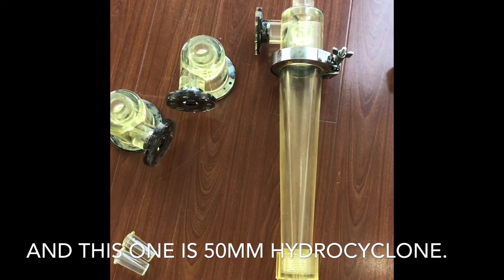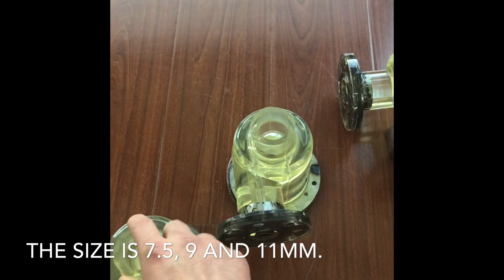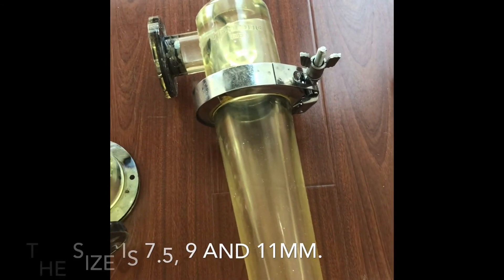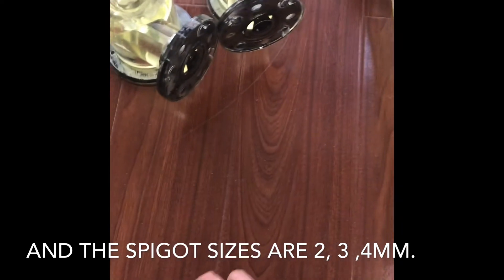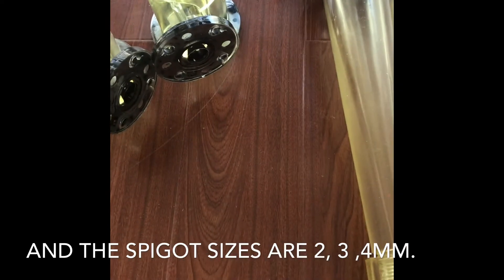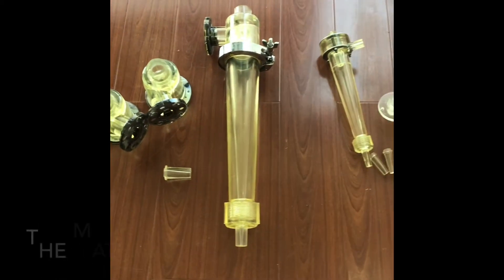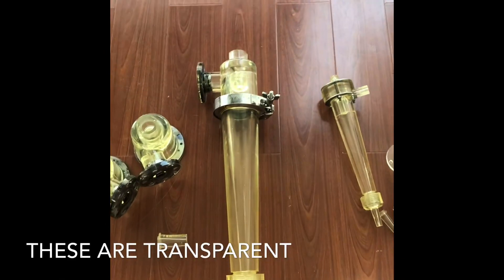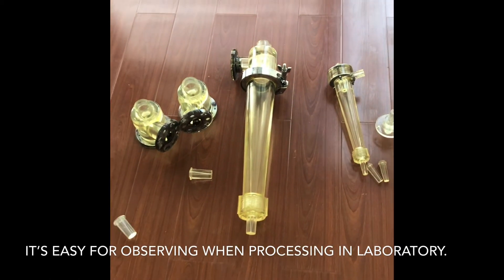This one is a 50 millimeter hydrocycle with different sizes of vortex finger — the sizes are 7.5, 9, and 11 millimeter — and the spigot sizes are 2, 3, and 4 millimeter. The material is polyurethane. These are transparent, making it easy for observing when processing in the laboratory.